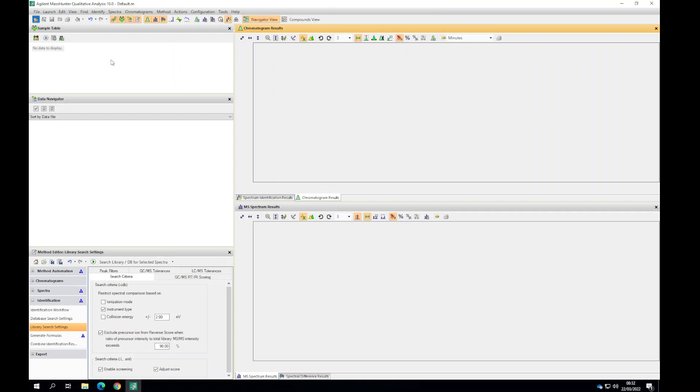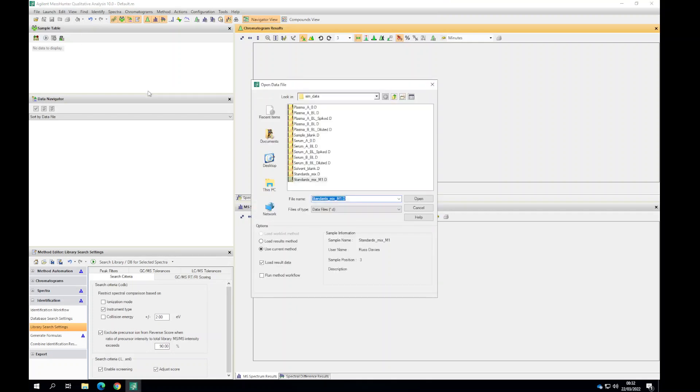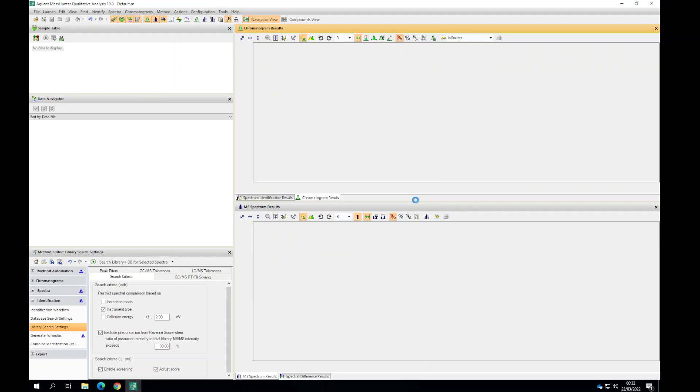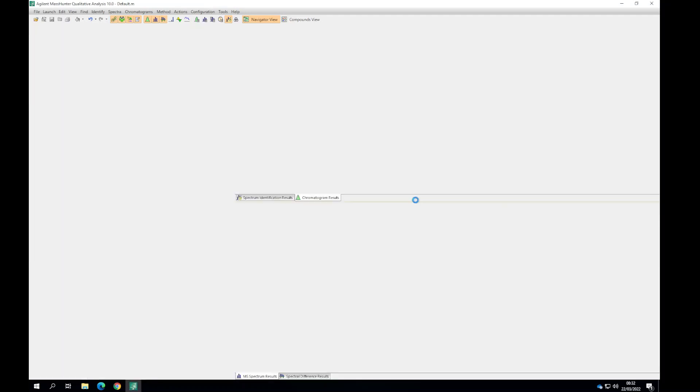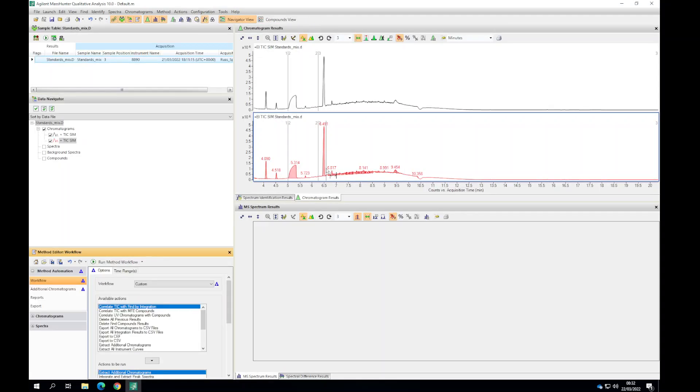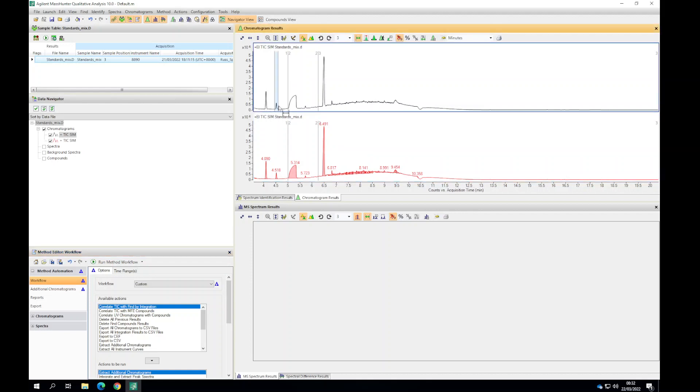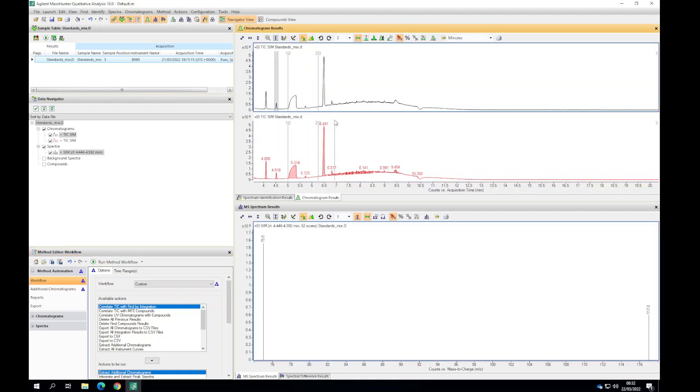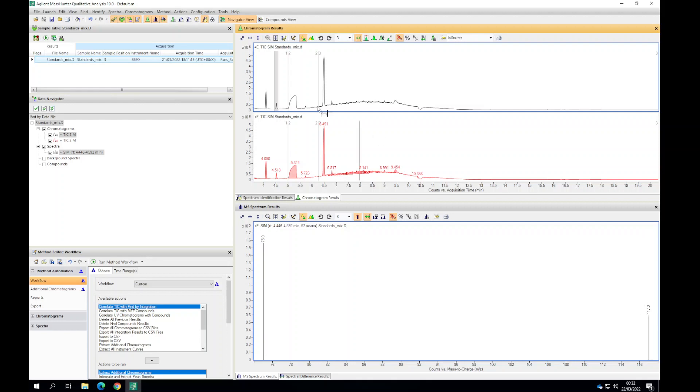We're going to look at some single ion monitoring data. From our full scan data we created a method using the qualifier ions for our different analytes. In this case we created an acetic acid TMS derivative method where we're only looking for 75 and 117 ions.